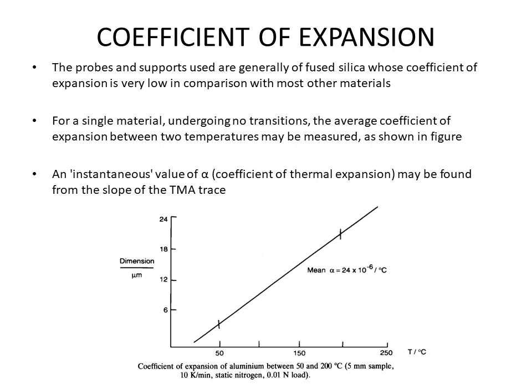Both of these things, probes and supports, are also available in other materials like Pyrex glass, aluminium, epoxy resins, and polypropylene. And why is fused silica preferred? Because its coefficient of expansion is very low in comparison with most other materials.